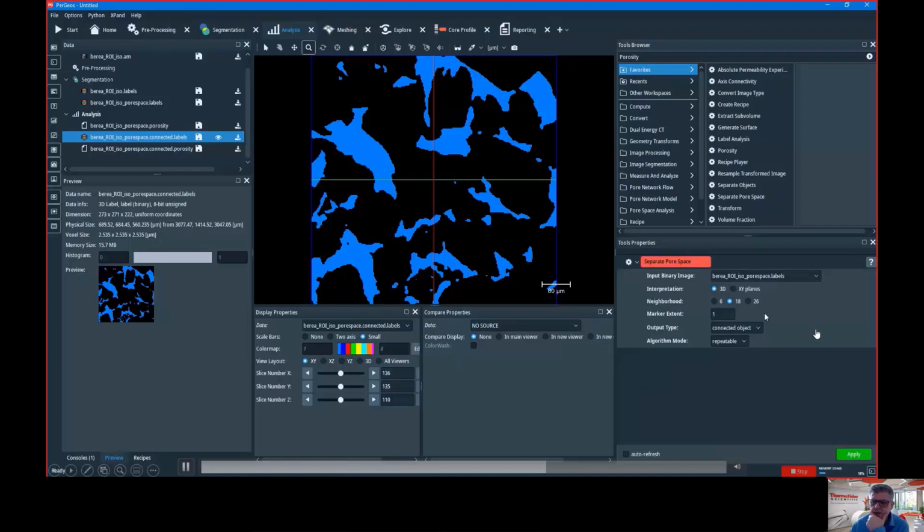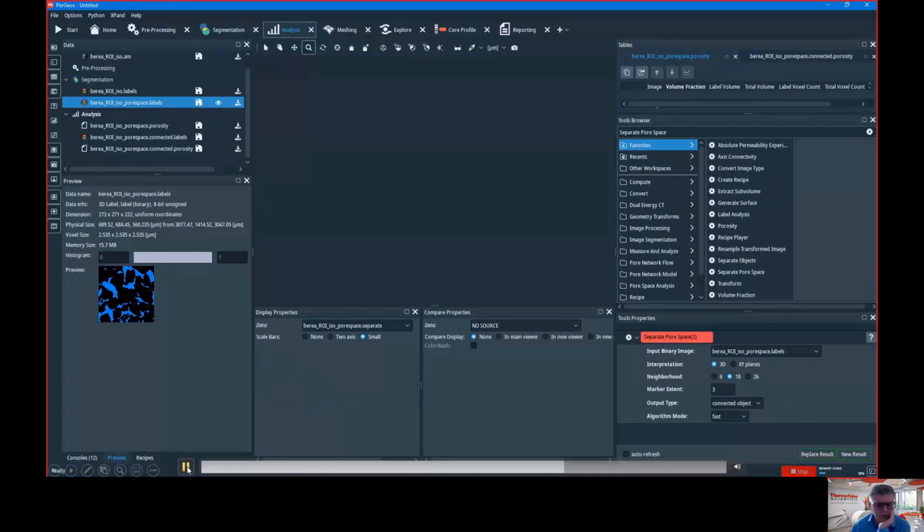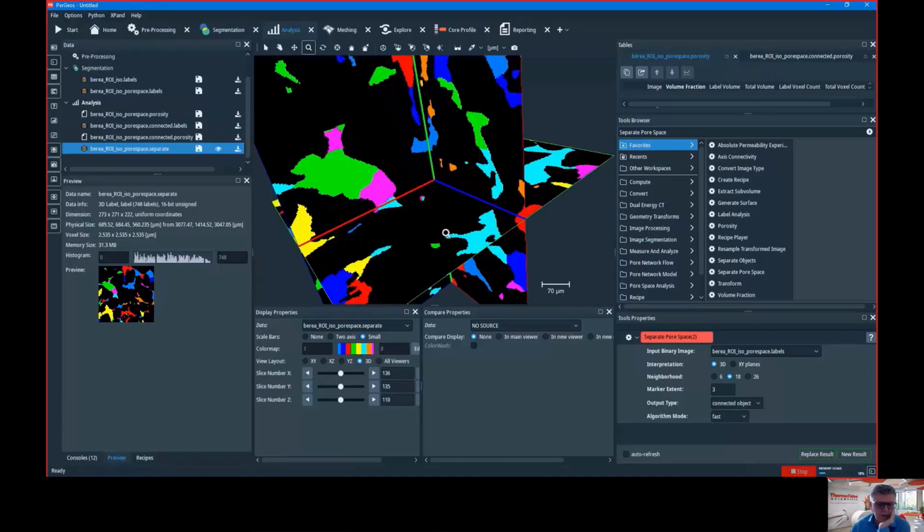Okay, then the default is already pretty good. Fast and repeatable. It's a tiny detail. So you get the computation. The computation at the end is the same. I mean, the two software in terms of image processing engine, they share the same platform.